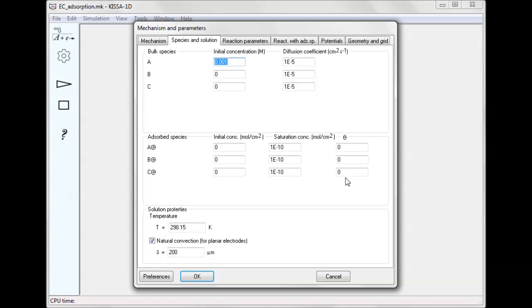This rest period, whose duration and potential are set on the potential step, is long enough for the diffusion layer developing from the electrode surface to reach the boundary of the stagnant layer of solution. Therefore, the effect of natural convection on the mass transport in this system should be taken into account as done in this case. Delta here is the thickness of the stagnant layer.